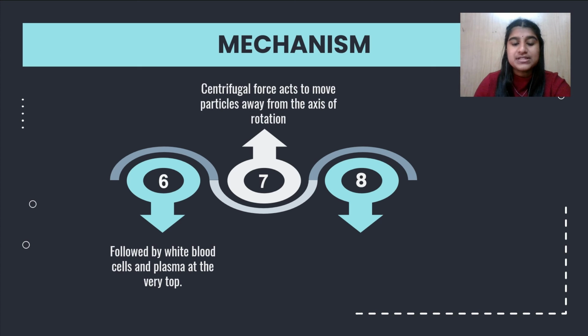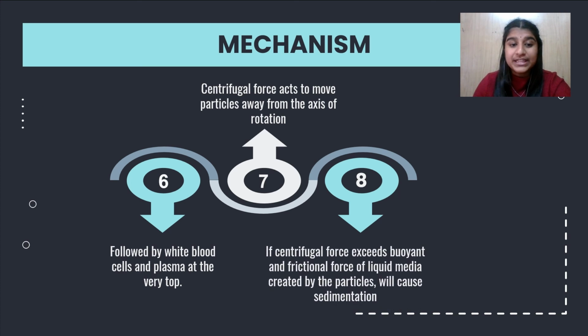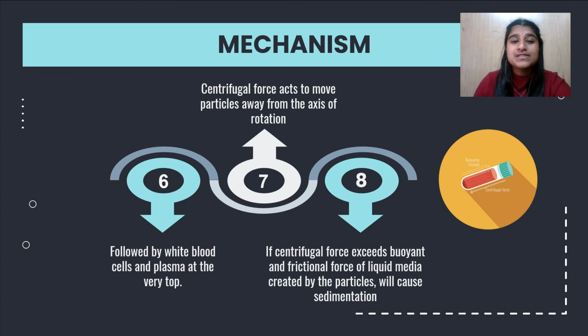Next, as the rotor spins around a central axis, it generates a centrifugal force acting to move particles away from the axis of rotation. During centrifugation, heavier particles rotate at a longer radius and lighter particles rotate at a shorter radius. If the centrifugal force exceeds the buoyant force of liquid media and the frictional force created by the particles, they will sediment. This figure here illustrates the relationship between the centrifugal force and buoyancy friction within a solution.